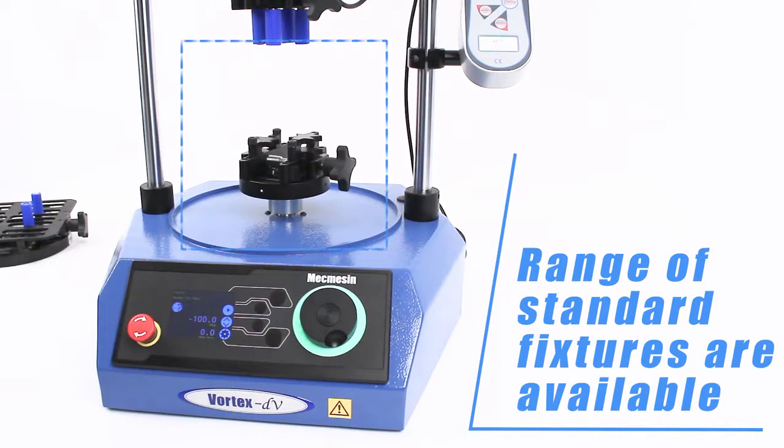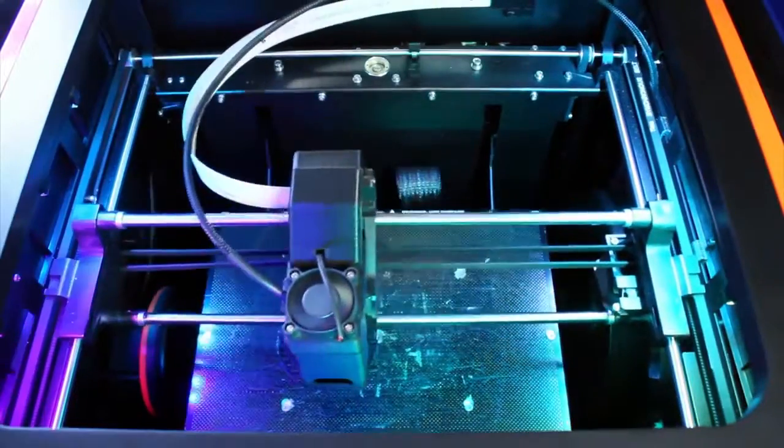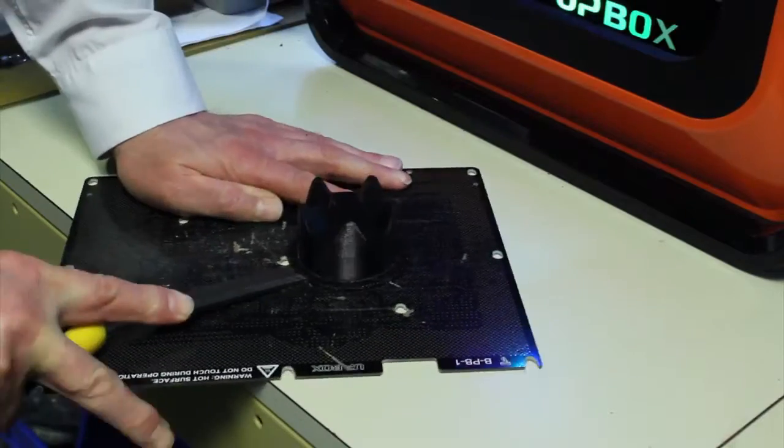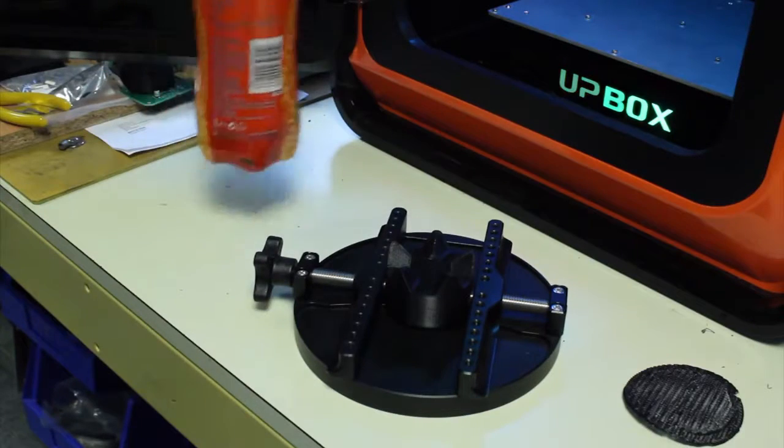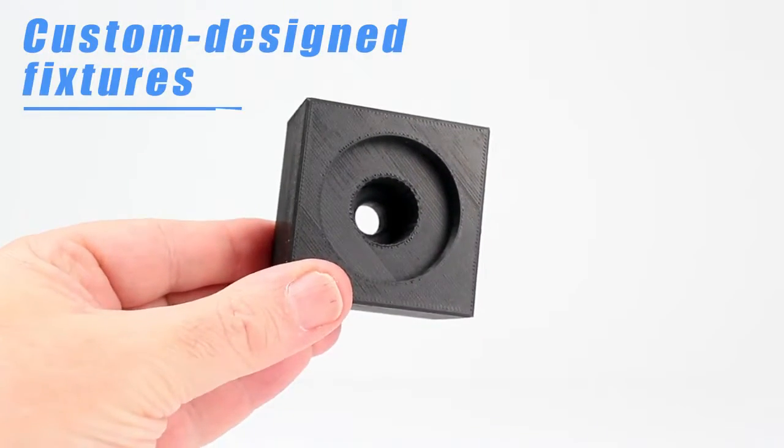However, if a custom designed fixture is required, we have an expert in-house design and manufacturing team focused on custom designing grips and fixtures, for example, cap mandrels, to your exact requirements, assuring axial alignment, secure holding and minimal deformation that might adversely influence test results and repeatability.